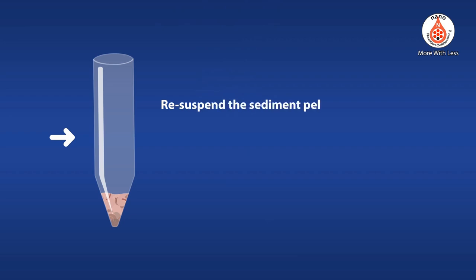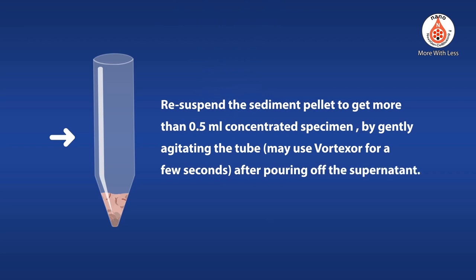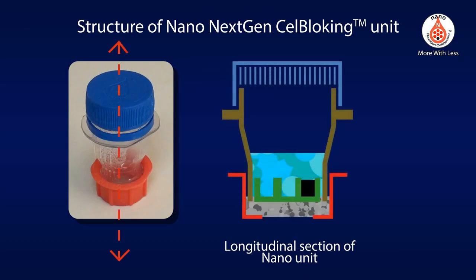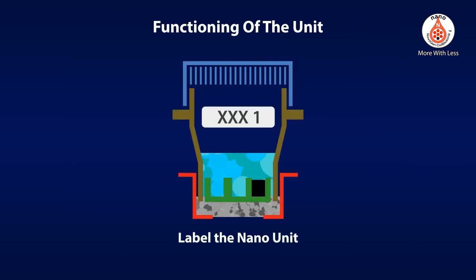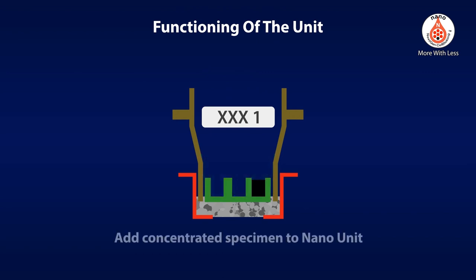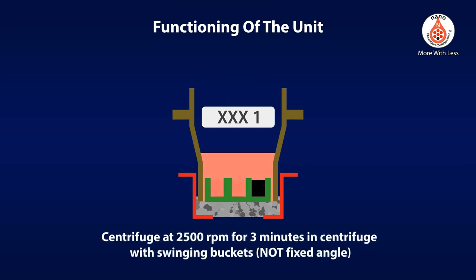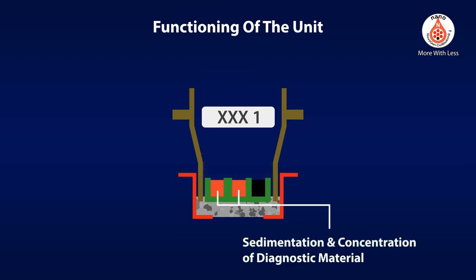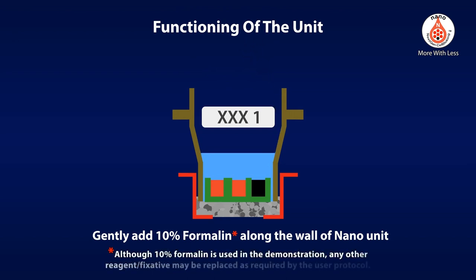Re-suspend the sediment pellet to obtain more than 0.5 milliliters of concentrated specimen by gently agitating the tube. You may use a vortexer for a few seconds. After pouring off the supernatant, review the structure of the Nano next-gen cell block unit. Although 10% formalin is used in the demonstration, any other reagent or fixative may be replaced as required by the user protocol.